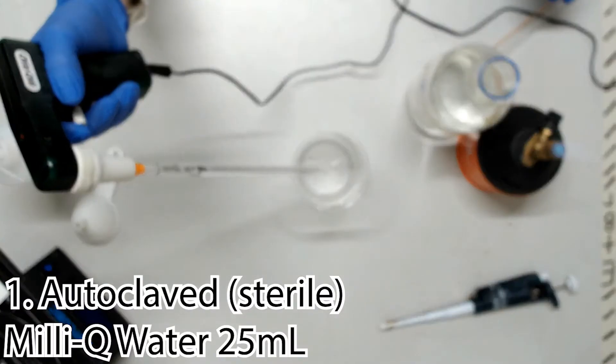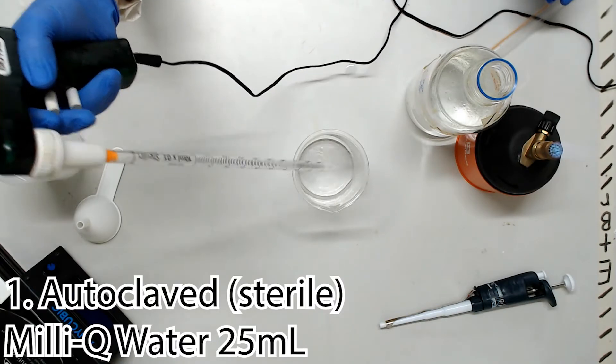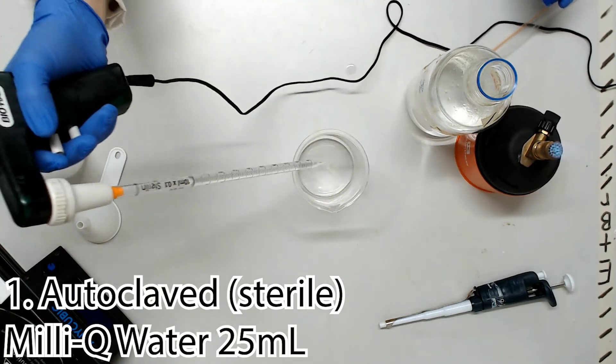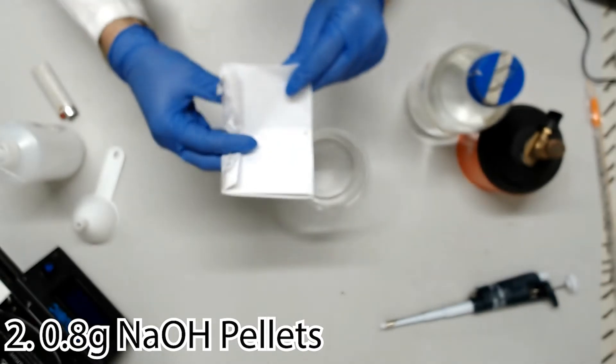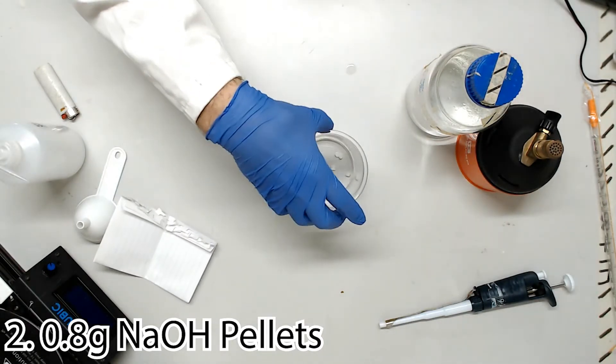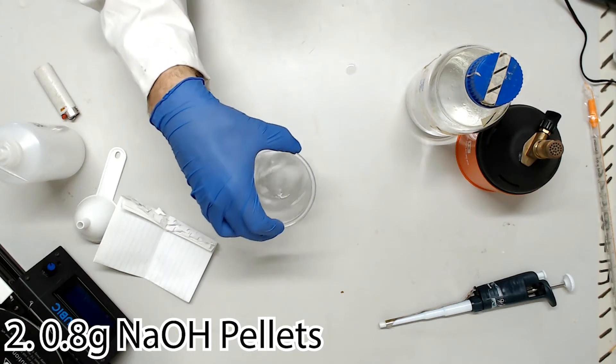We will start with about 25 mils of sterile purified water in a clean beaker, to which we will add 0.8 grams of sodium hydroxide pellets, mixing slowly to allow them to dissolve. This will take a bit of time.